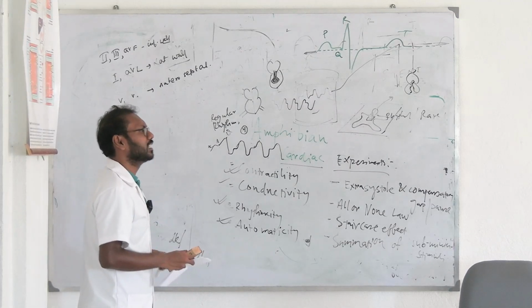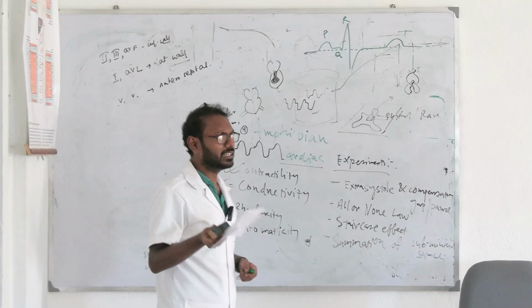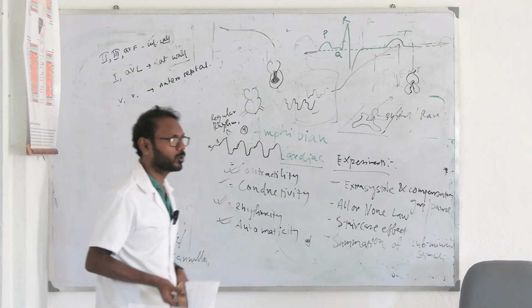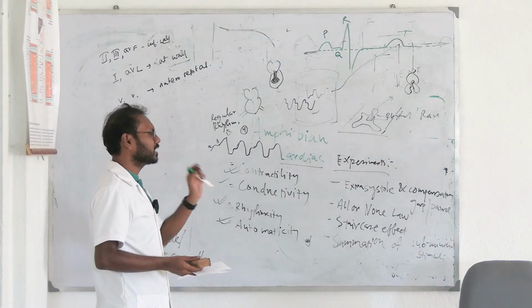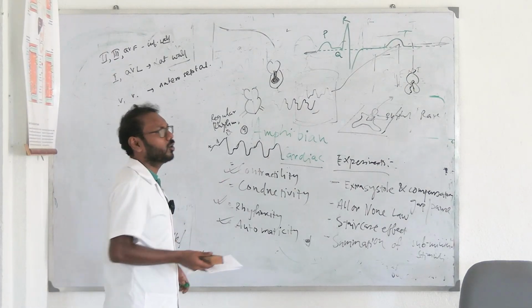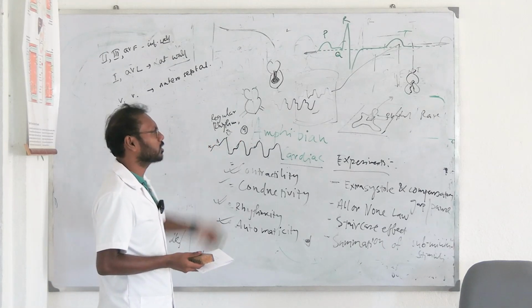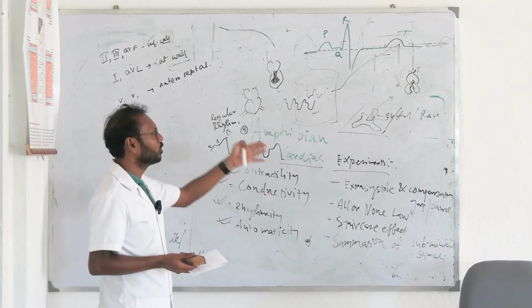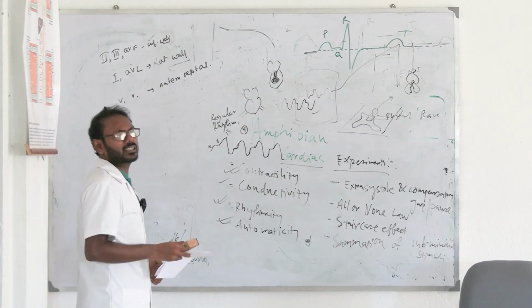you need to mug up a little extra things, like you have to remember whenever we are doing drugs and ion tests, you have to provide ion solution like calcium chloride, sodium chloride, whatever ion we will be checking for, we will be providing the solution. So these things you will need to put down extra. Okay, but on the basis of it, it's not possible to forget all the things, because if there is no frog, if there is no board, okay, if there is no myograph, how will you conduct the basic experiment?